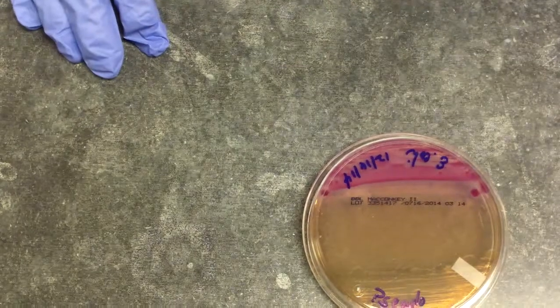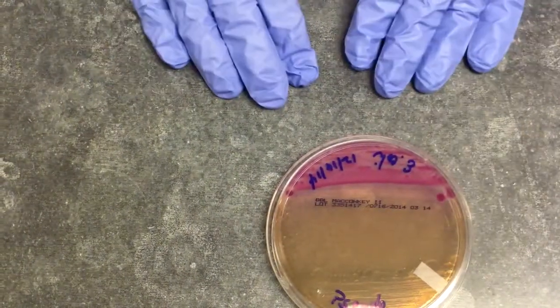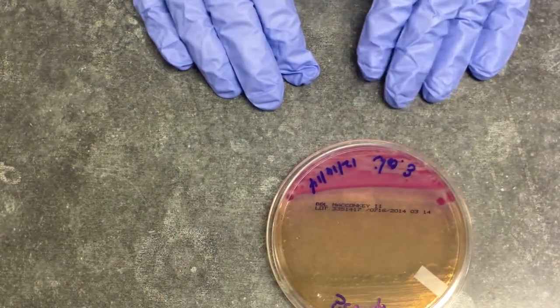Next, we have differential agar, and our differential agars allow us to, I messed up.